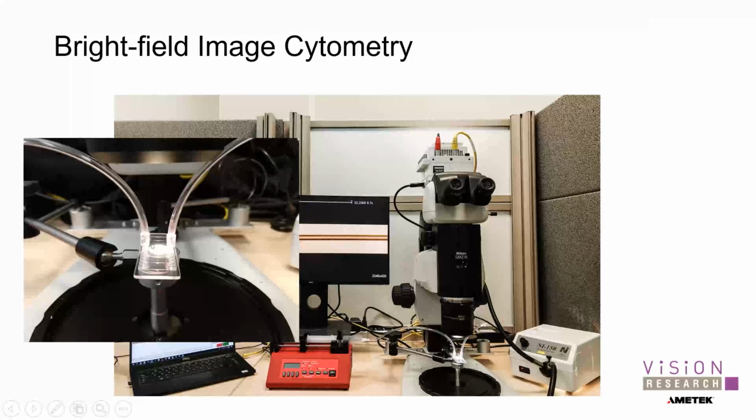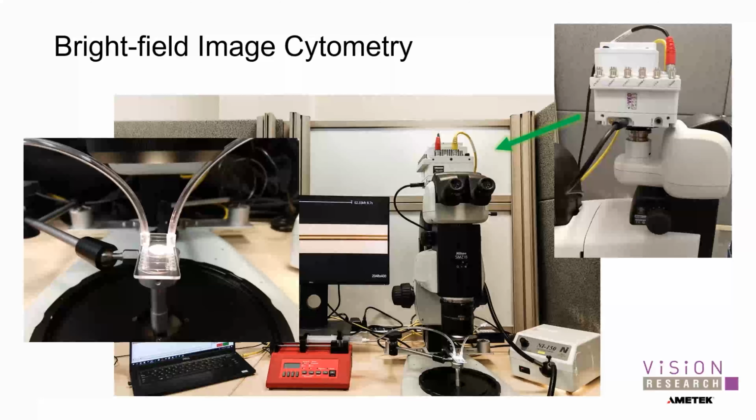Okay, here's a close-up view of it. And then this microfluidic chip is backlit using a fiber LED. And essentially photons go through the sample, and then the refractive index gradient of the cell environment will create contrast onto the image sensor. Okay, so the camera integrates directly into that microscope just with a C-mount adapter. All right, plugs right on in.